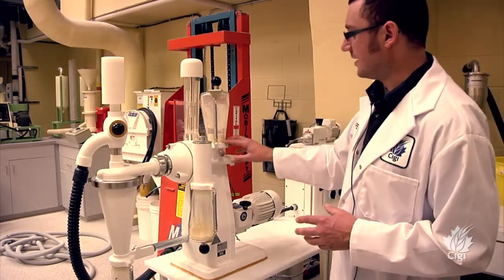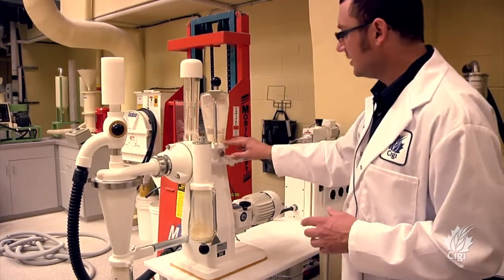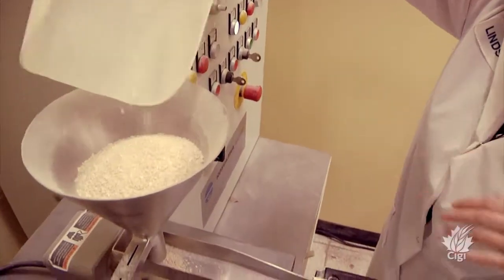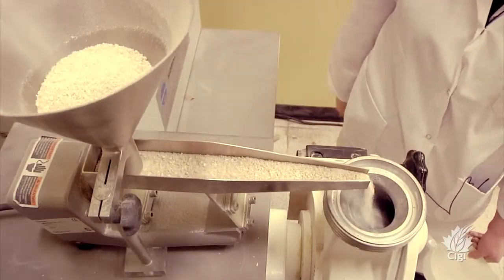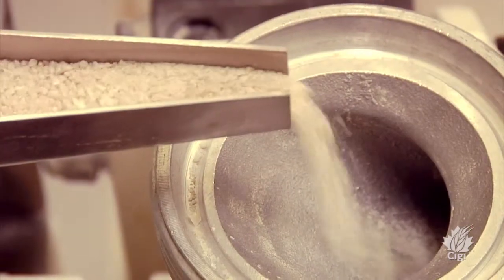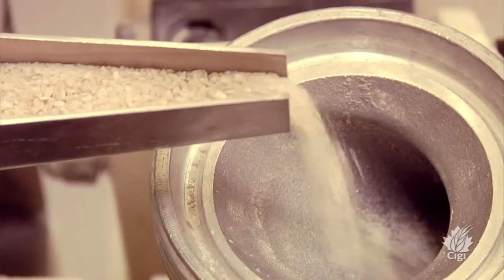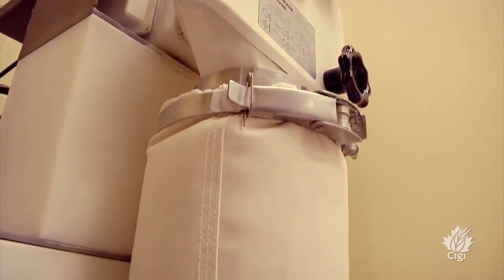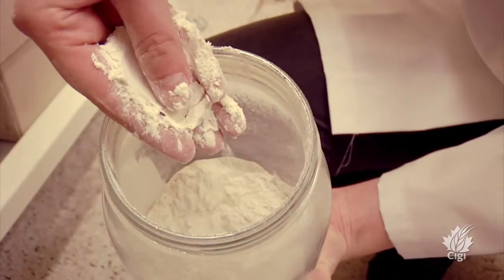The flour that goes in here must be very finely milled, usually impact milled or pin milled, to get a particle size a little bit smaller than your regular white flour. The particle size would be between 20-30 microns all the way up to maybe 80 or 100 microns, whereas regular flour is a little bit above 100 microns.